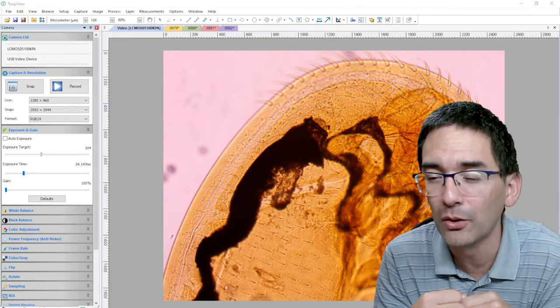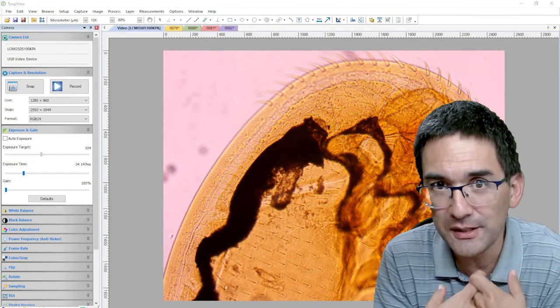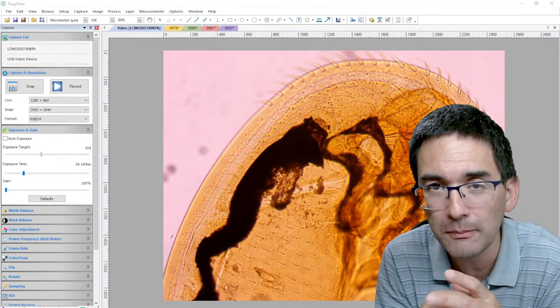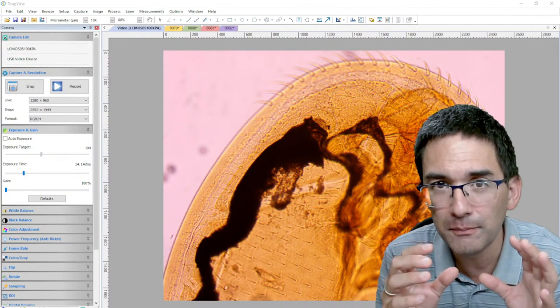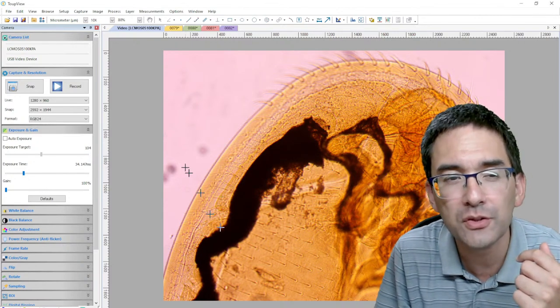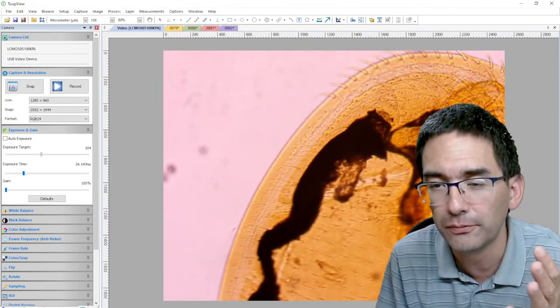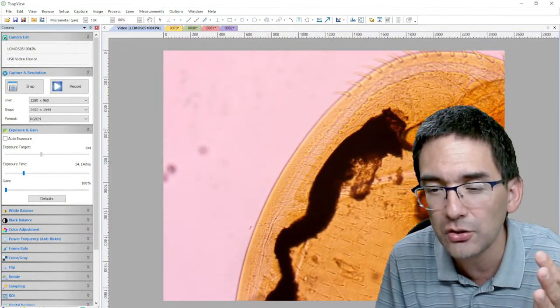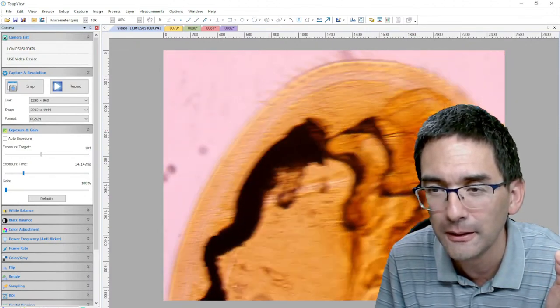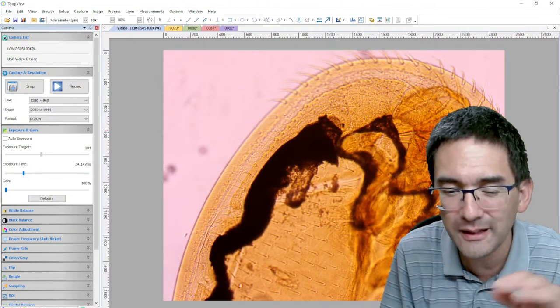There is a comment here about videos. What I do is the following. That's actually the content of a different video or live stream, but sometimes when I want to make a video, let's say of this mite, I use the XY stage. I'm not able to turn it very smoothly, and if I make a video like this, it's not so smooth.